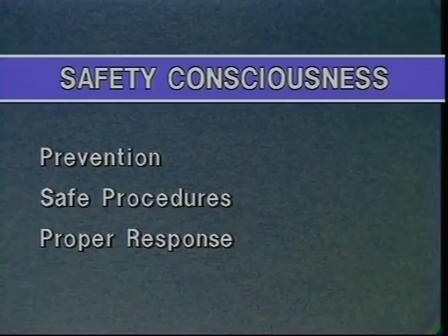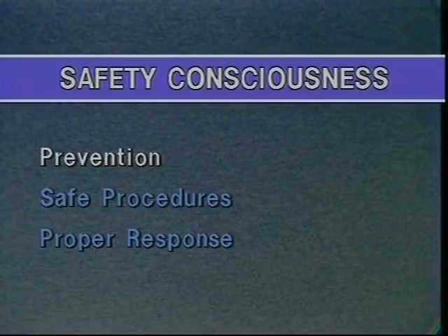It's imperative that you do not panic. Careful, methodical, and immediate action can often mean the difference between minor and serious injury. We'll talk about what you should do when an accident happens to you or someone else. Now, let's start first by talking about prevention.